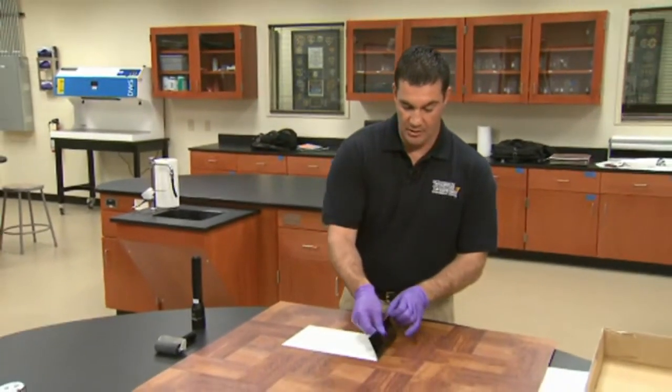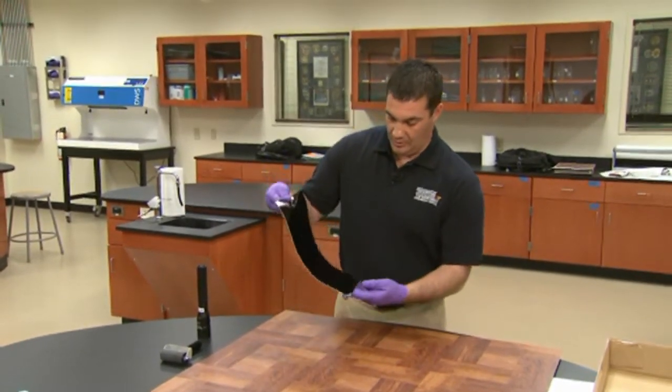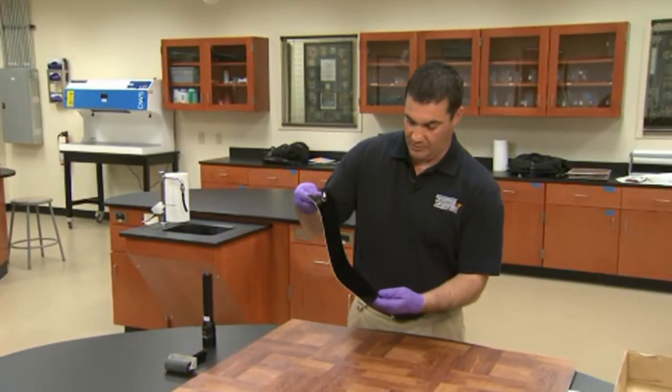Now, this gel lift has been demonstrated without showing photography of the footwear impression prior to putting the gel lift down. Obviously, we would want to document the location of that footwear impression and photograph it with and without scales in place prior to collection. Now we're ready for the collection of it — simply pick up one end in one smooth motion and remove it from the substrate.